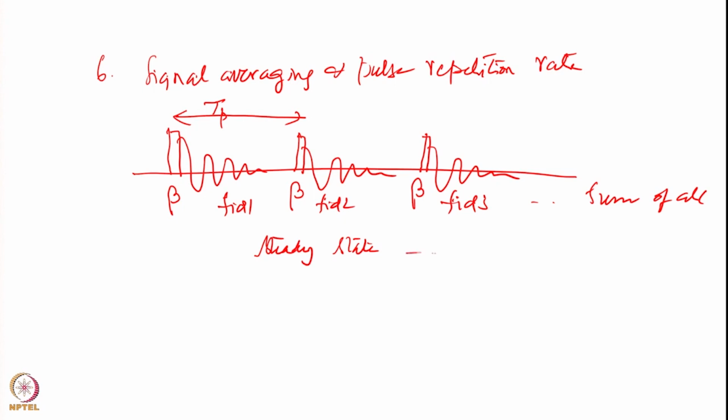So, this requires optimization of the flip angle beta and Tp. Let me write the expression for that.